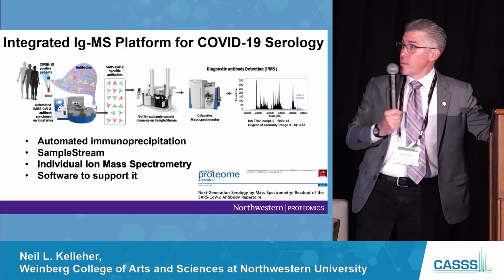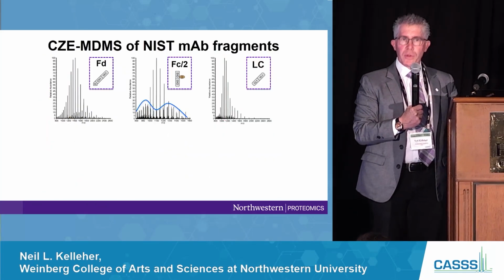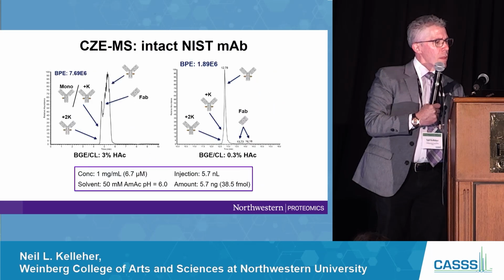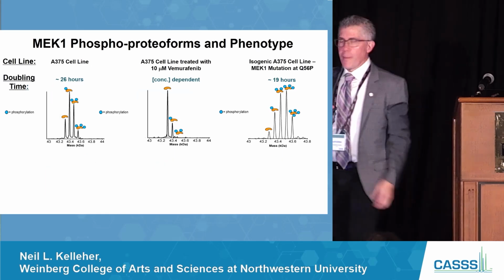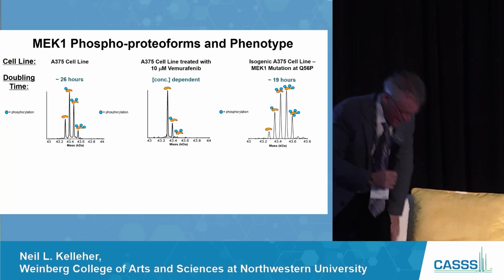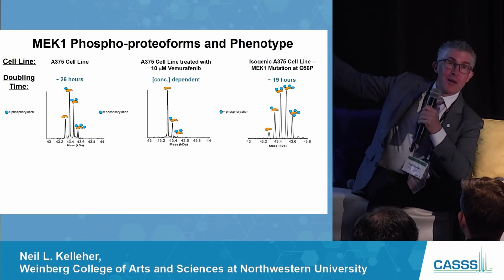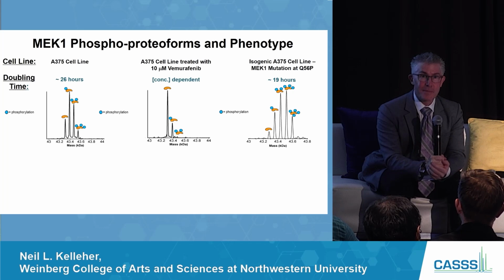It's the same platform here, by the way, the immunoenrichment of MEK1. We would need about 50 milligrams of melanoma resected tissue, and I'd love for that to be from someone on the drug vemurafenib or any of those other inhibitors. I can't find that MEK1 slide, but yeah, oh, there it is. Yeah, it's cell lines. You got me. Cancer docs, the tissue is the issue, right? Yeah, Jenny Van Eyck, the tissue is the issue. I don't know if you have a study design with 10 patients in different categories, but if you do, let's talk. Thank you.